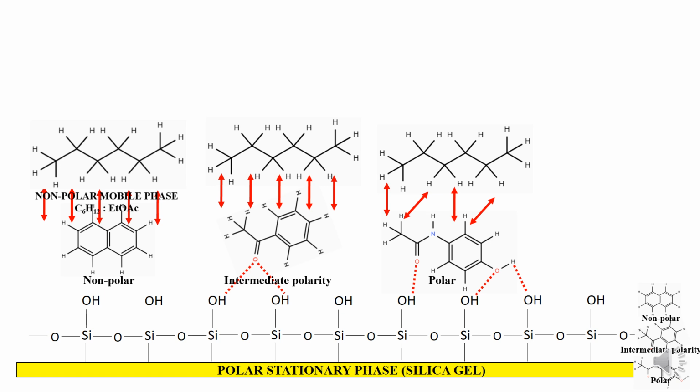And therefore, the major force that is dragging the non-polar naphthalene molecule over the length of the stationary phase is van der Waals attraction. So it is van der Waals attraction which is governing the motion or movement of the non-polar molecule.